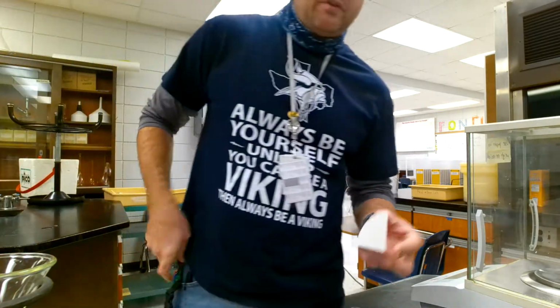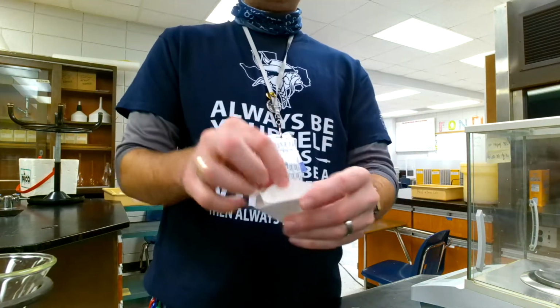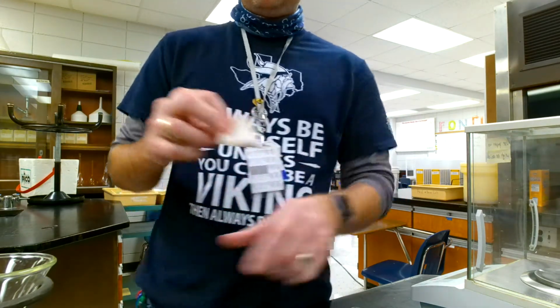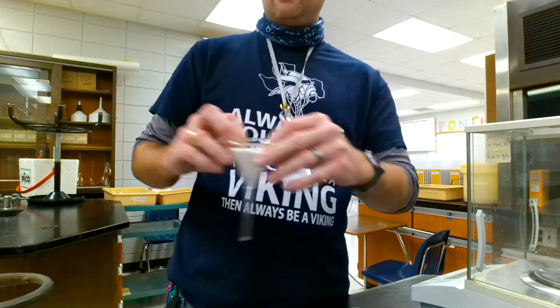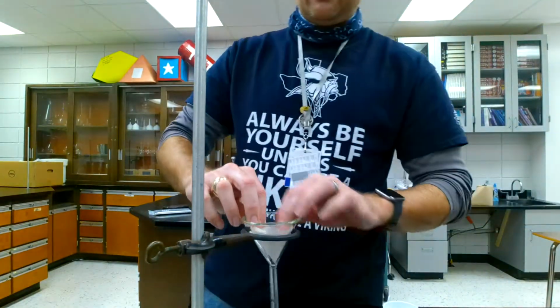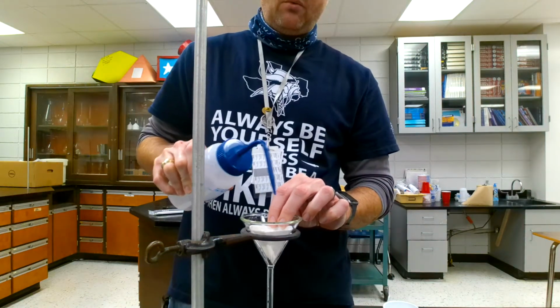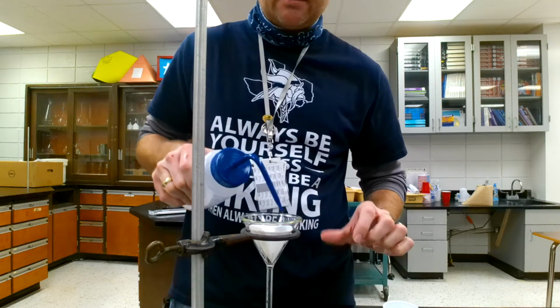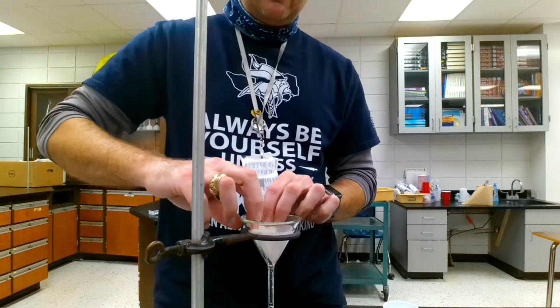And I'll move on. You take this folded piece of paper and turn it into a cone like that, so it fits nice and neat in that funnel. Now the best way to do that is, once it's in there, you wet the filter paper so that it sticks to the sides, and it's good to go. It is ready to filter.